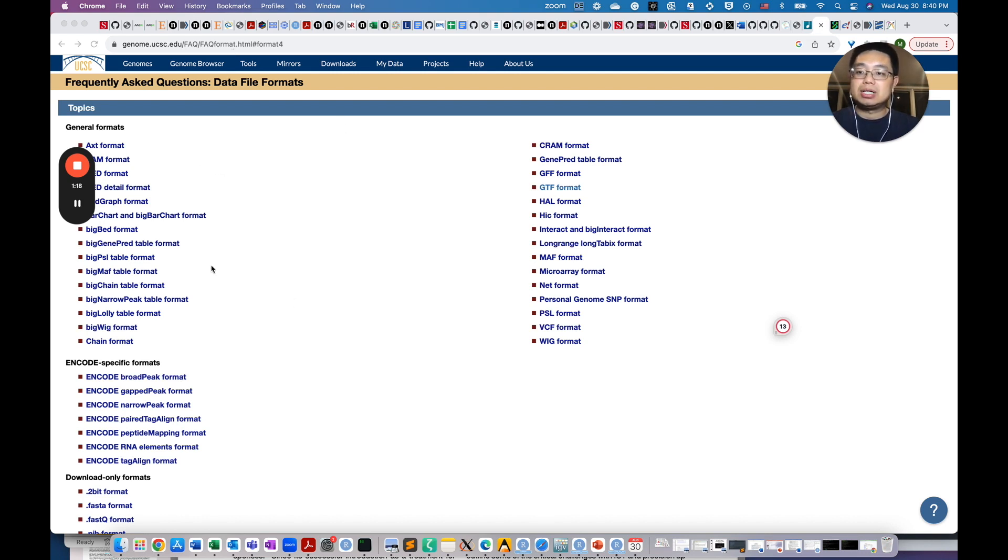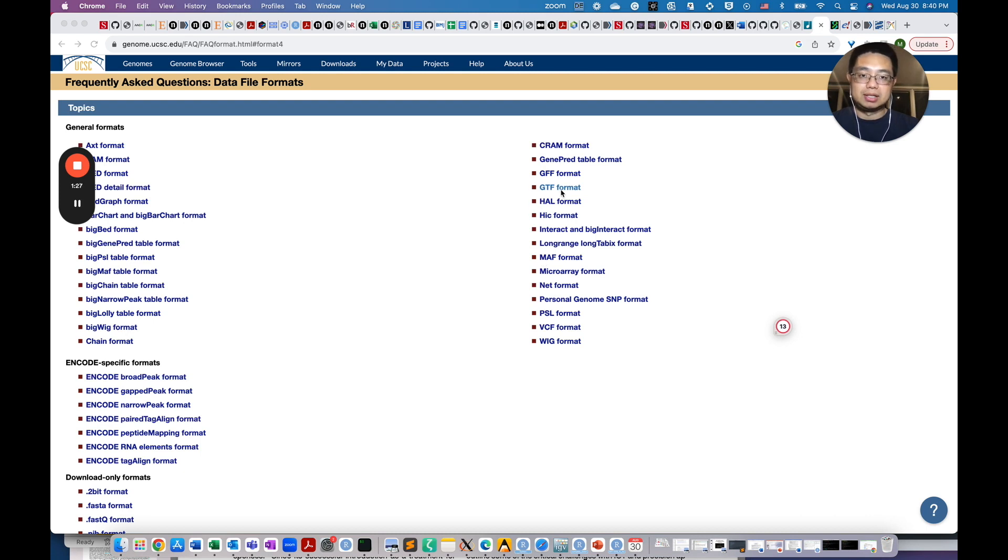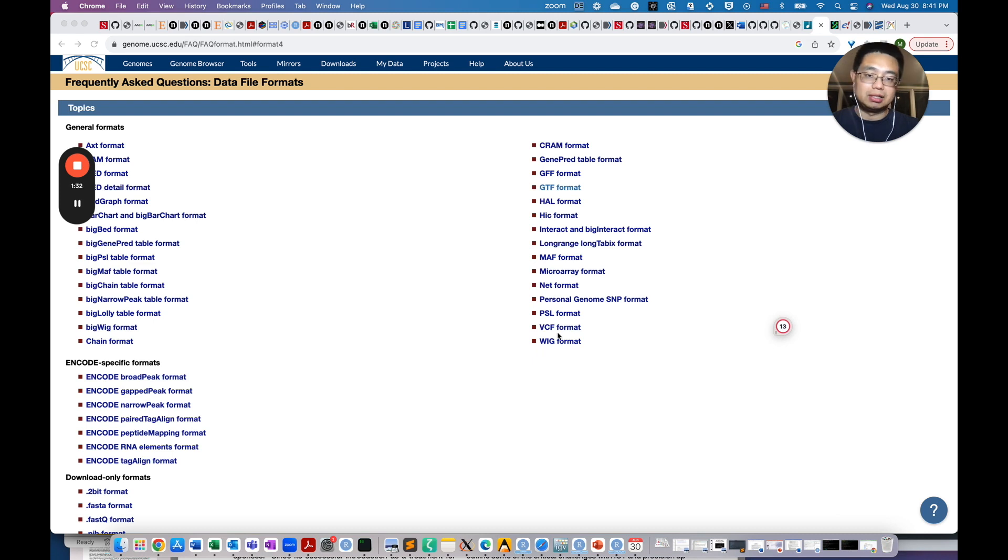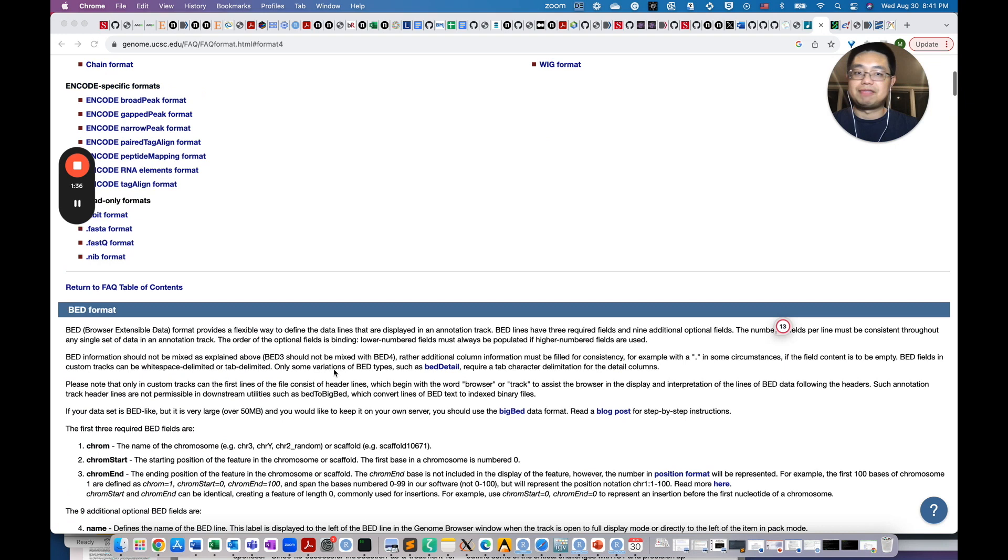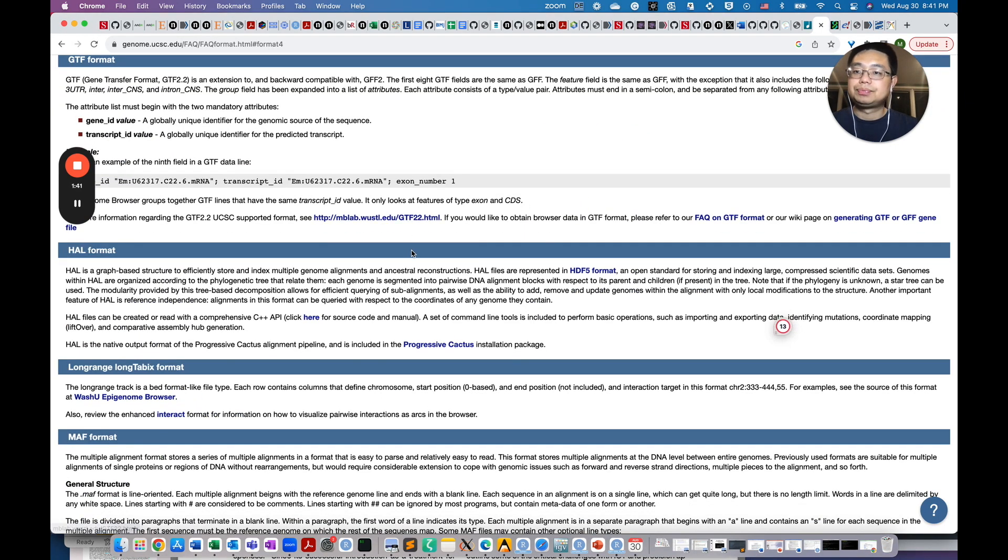In this page, it tells you all the differences or the definitions of all the different file formats. For example, GTF file, the gene annotation file, and other file formats like VCF file, the variant calling format, or wig file, or different file formats. If you click that, you will see the definition and the example.